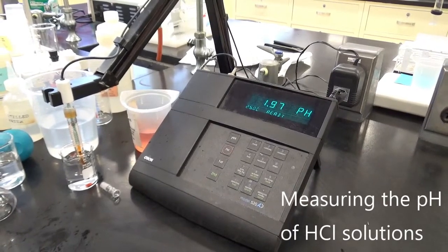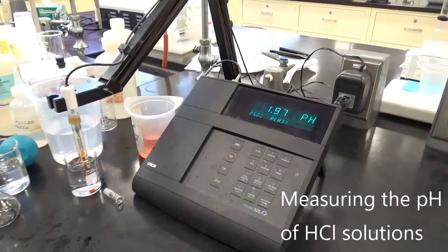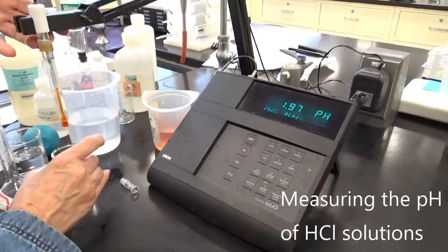Okay, 1.97. So I hope you're recording that data on your data sheets. The first pH was 1.00 for 0.10 molar HCl, and now it's 1.97 for the first dilution.